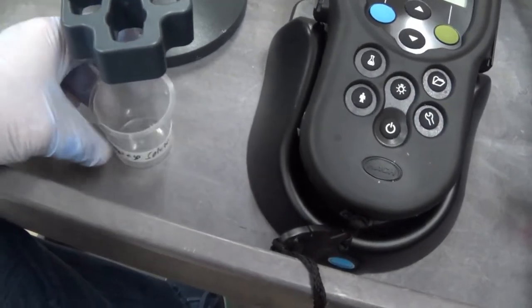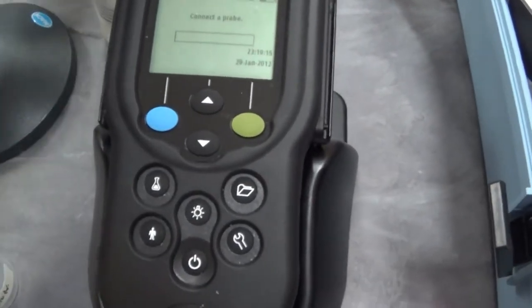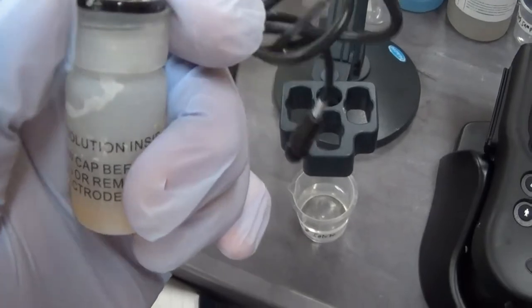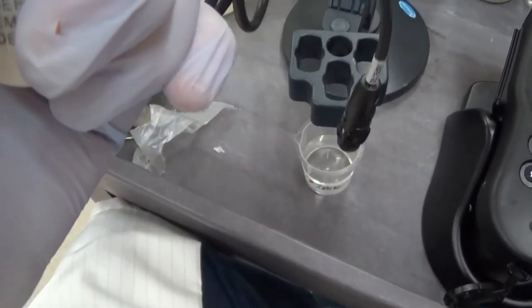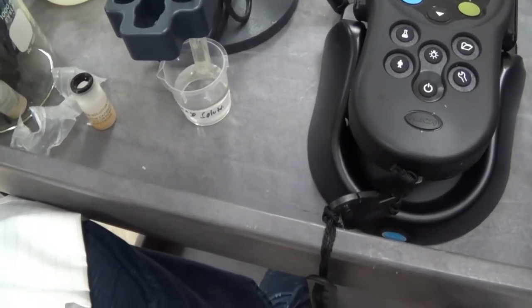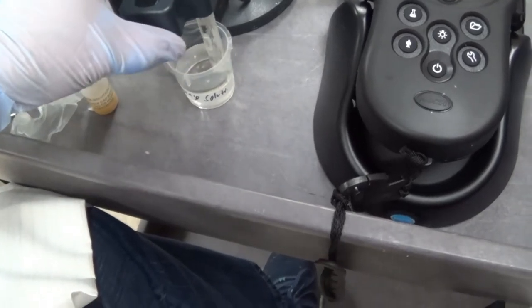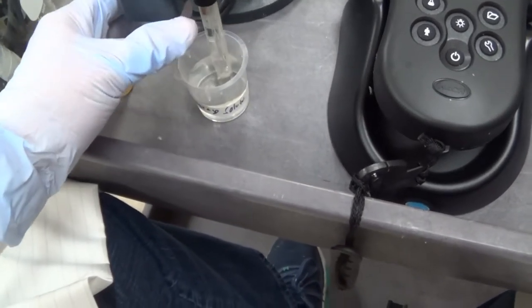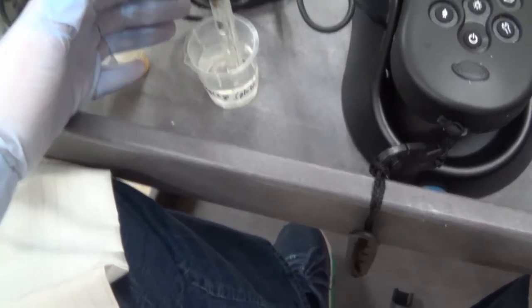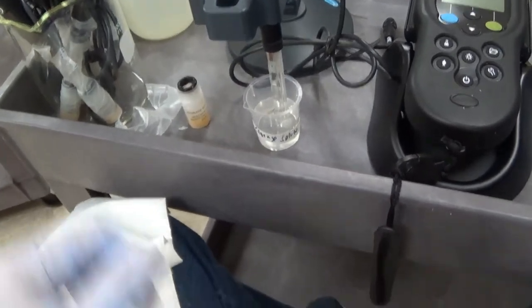I am going to pour off some storage solution. I unparafilmed the probe. I just loosened the cap here and it relieved some of that pressure and pulled the probe right out of it. I am going to put the probe in the stand in the storage solution. It is in the storage solution right there.